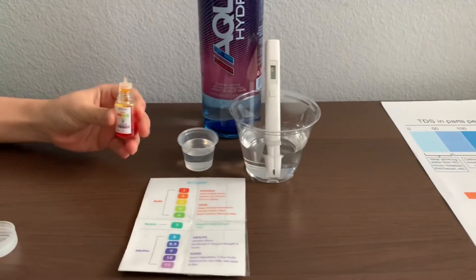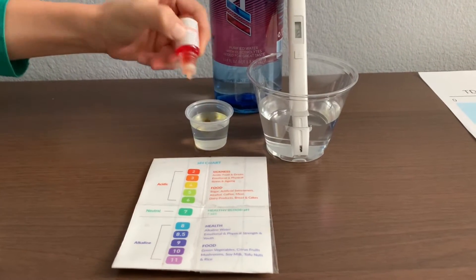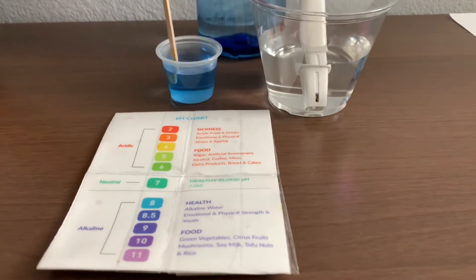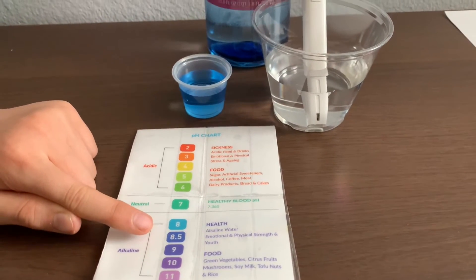Now let's test the pH level. Only do two drops. Let's stir it all for a better result. I read this as 8.5 — this is alkaline water.